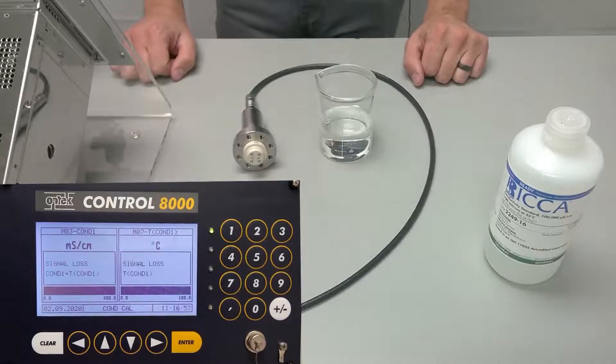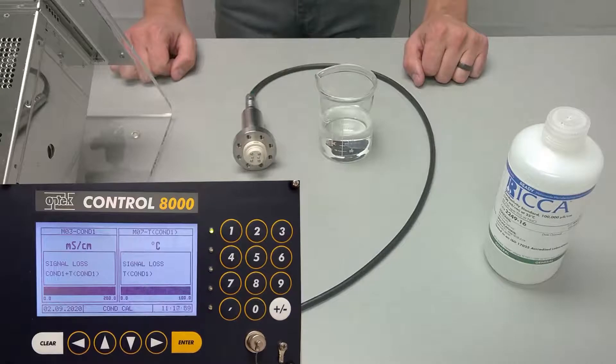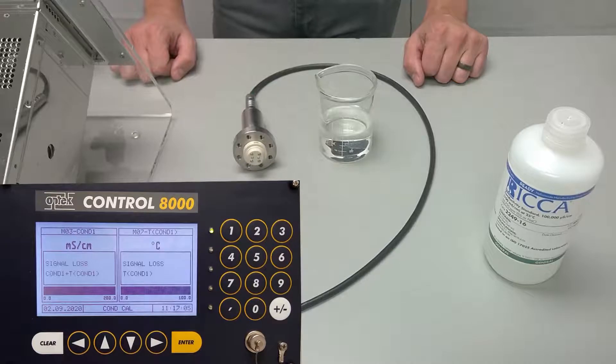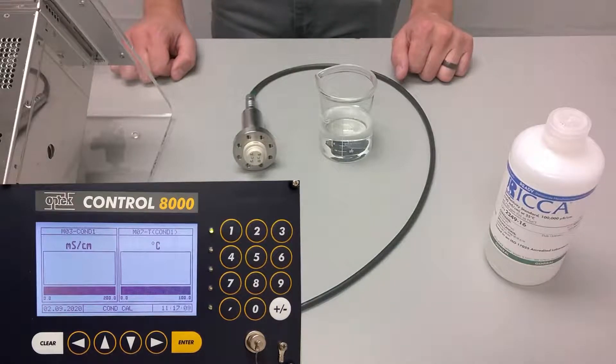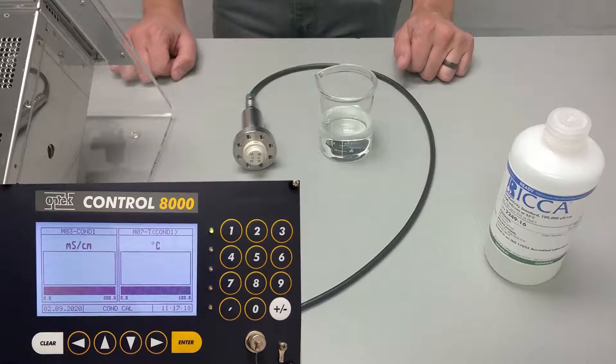In this video, we are going to perform a single point conductivity calibration using an OPTEC C8000 transmitter and an ACF60 conductivity sensor. In addition to the hardware, we will need a conductivity solution. We use a RIC 100 millisiemens standard.